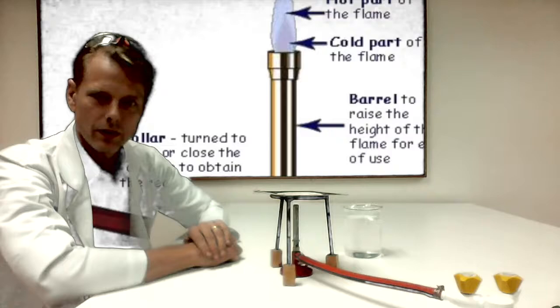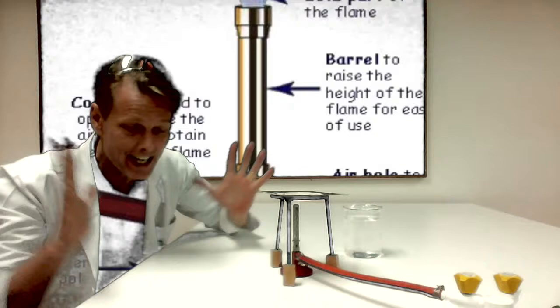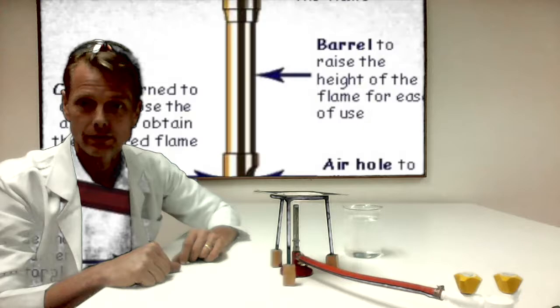Well, let me tell you, something is going on here. It's an oxidation reaction. It's fire. It's invisible fire. Crazy invisible fire. That's right. That's what's happening. You don't think? That's nothing.